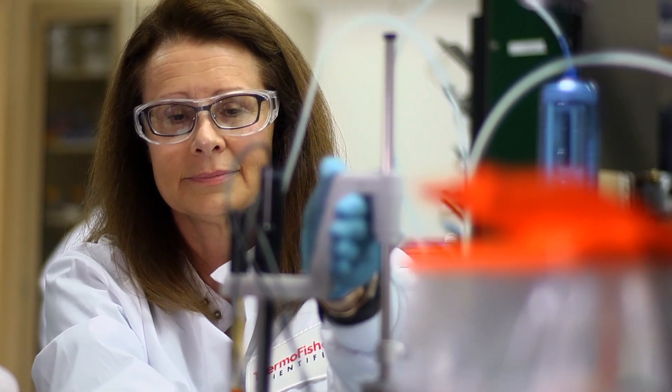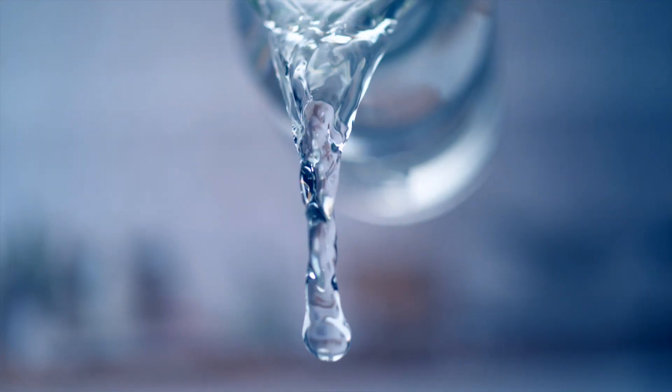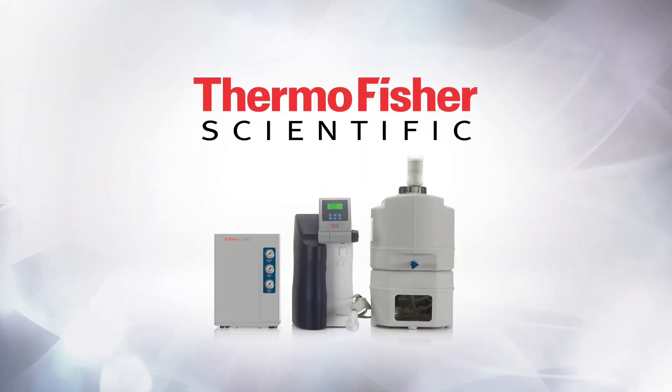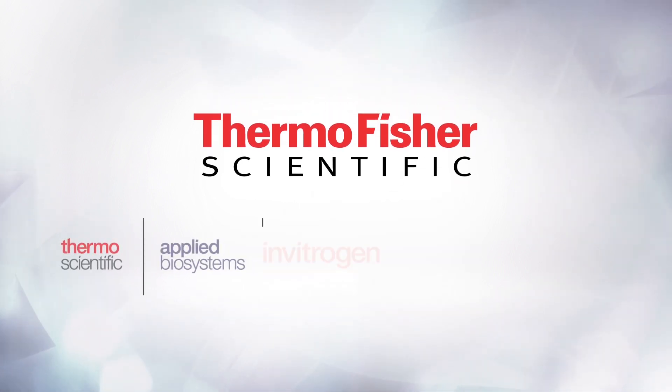Ensuring reliable testing, pioneering life-saving technologies — because we don't take quality water for granted. The Thermo-Scientific Barnstead SmartPure Pro Water Purification System. Because what you do, and how you do it, matters.